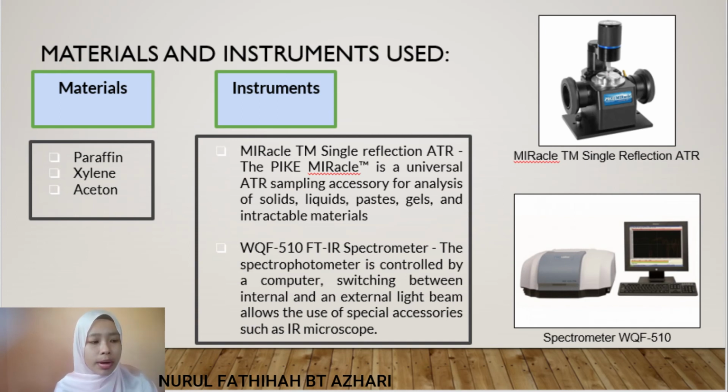The spectrophotometer is controlled by a computer. Switching between internal and external light beams allows the use of special accessories such as an IR microscope. Here, there are two pictures of the MIRacle Single Reflection ATR and the WQF-510 spectrometer.